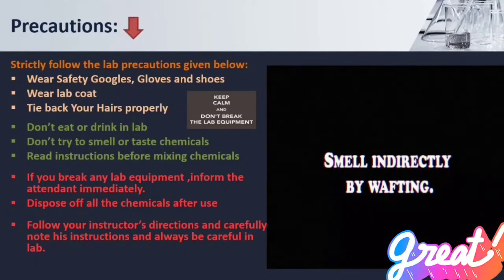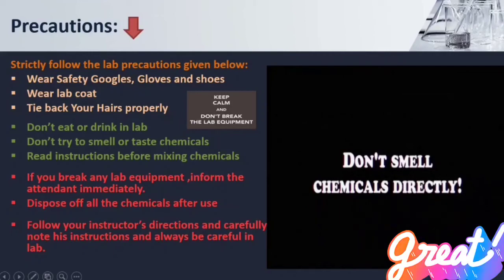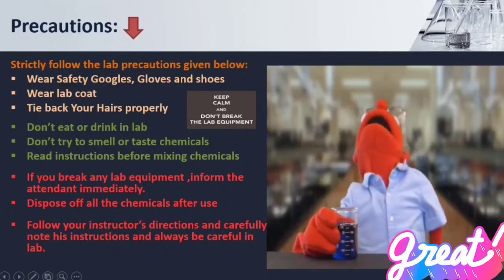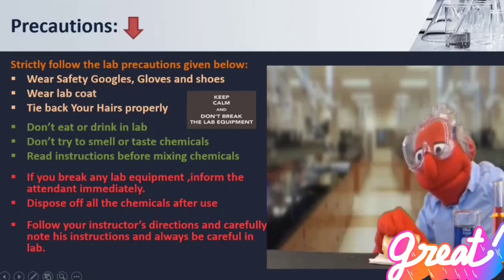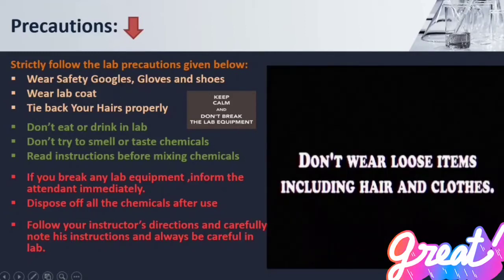Smell indirectly. Don't smell. Don't go inside.